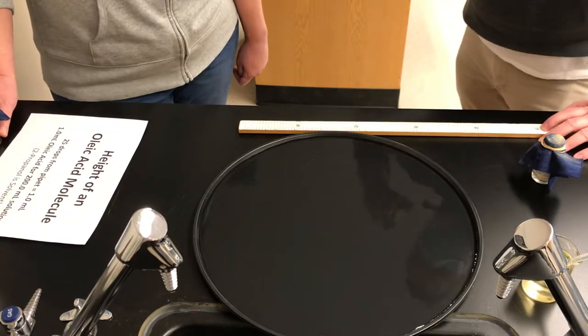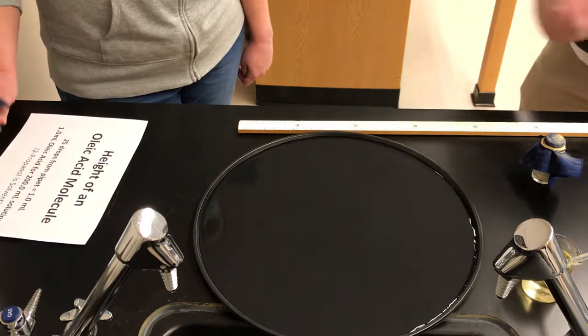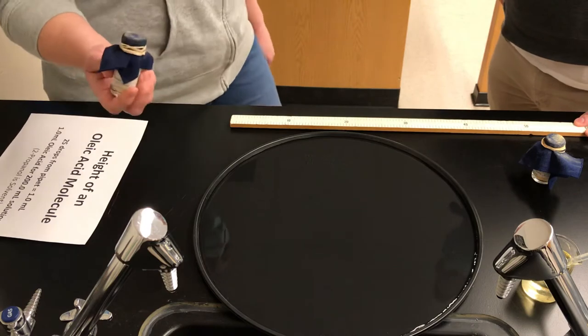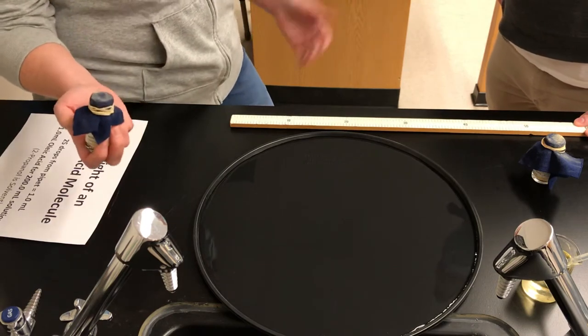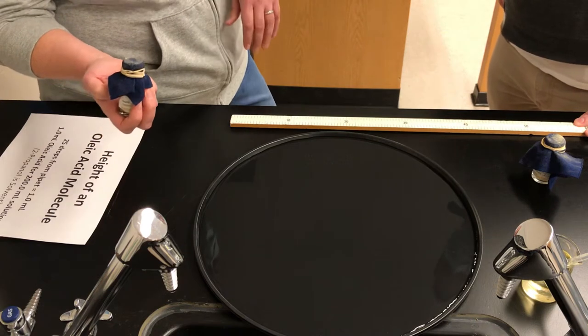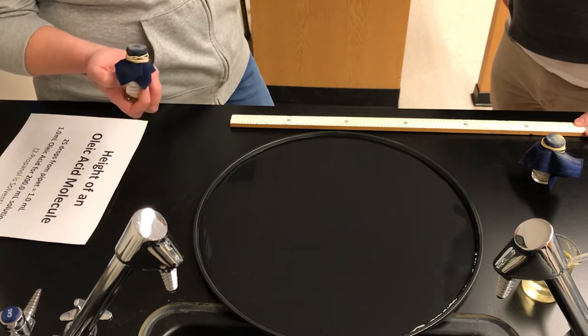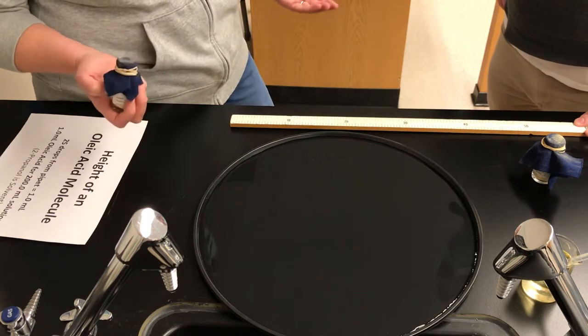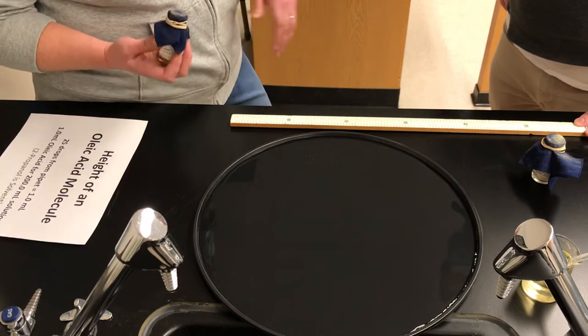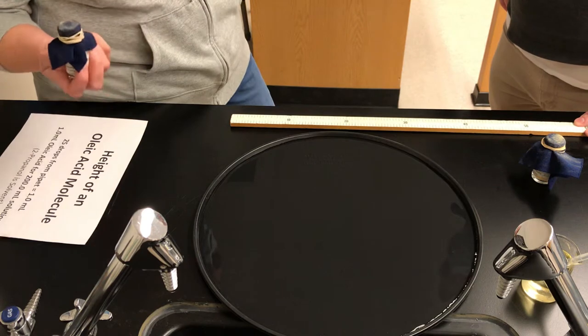And Ms. Watts, what are you going to be adding to that? So we're going to be adding very fine powder to the surface of the water. And so this is going to be important because when we add our drop of oleic acid solution, it's going to cause the powder to spread out to the perimeter of the pan. That's going to allow us to measure the diameter for which the slick spread out.